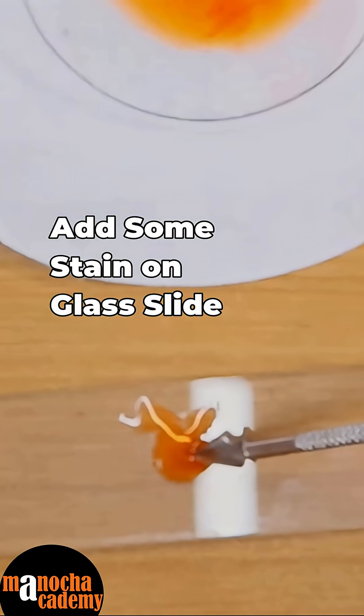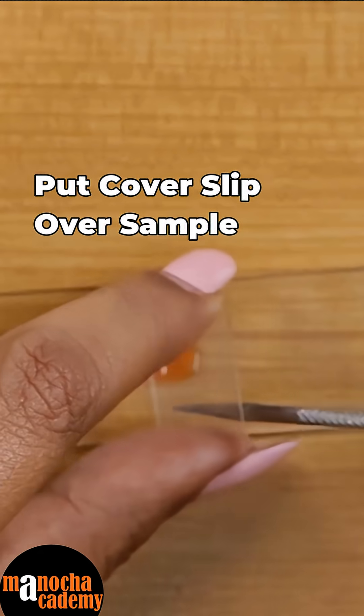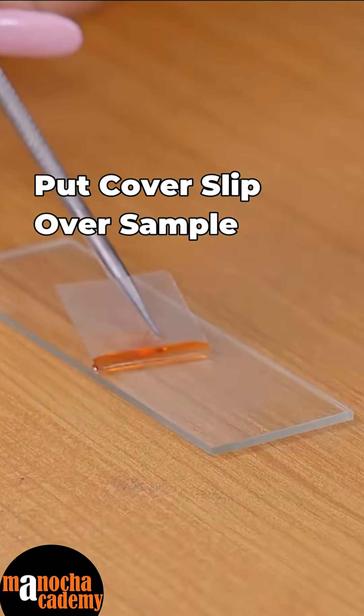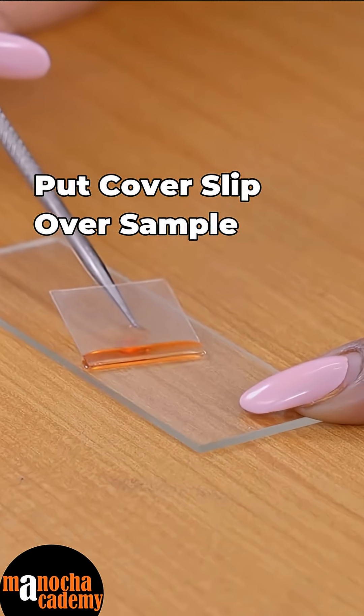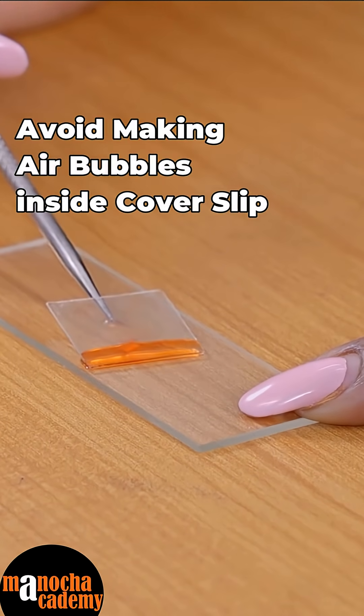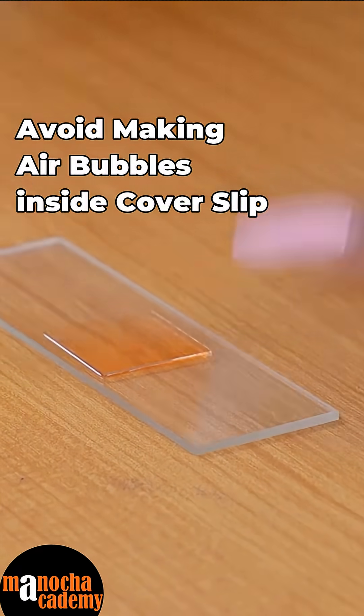Now quickly I will put some stain on it and I will put the cover slip. So you use a needle, touch the stain, touch the needle on the glass slide, and slowly drag the needle out — that way you will avoid putting any air bubble inside, and this is done.